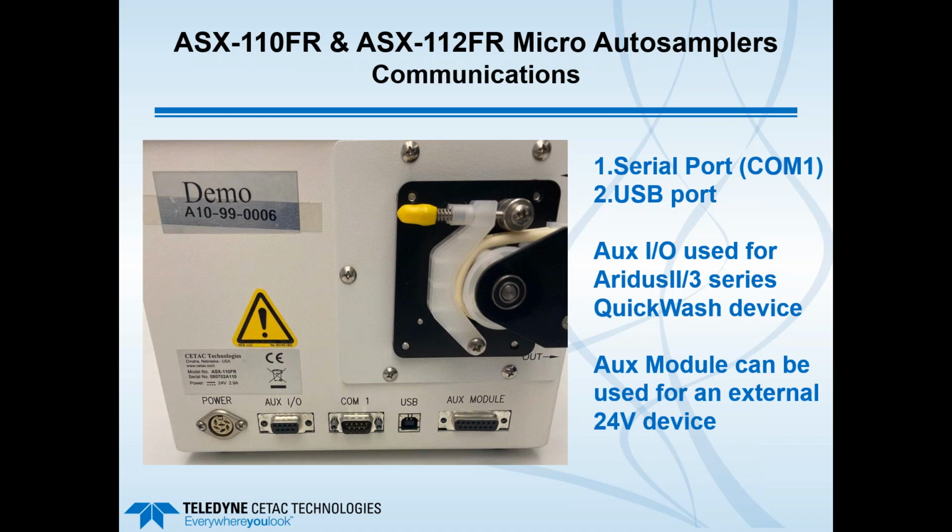There's also an auxiliary module, and that can be used for any other external 24-volt device that you may want to power. In practice, mostly if you do have the Quick Wash device for an Aridus II series unit, you would be using the auxiliary I/O port.